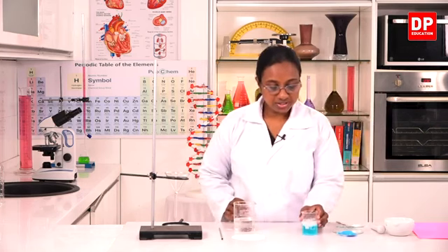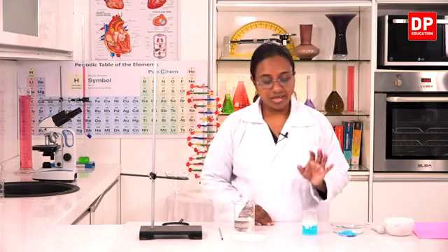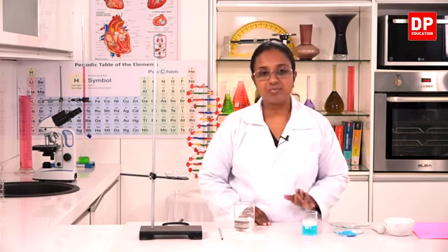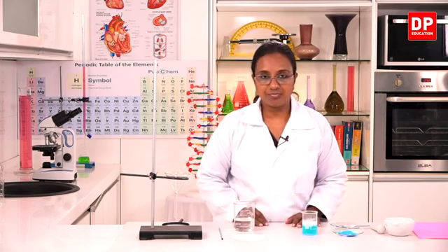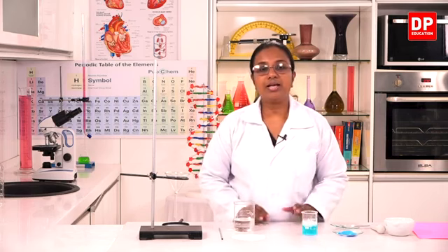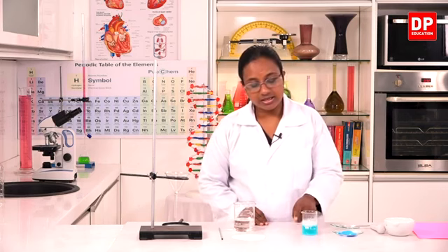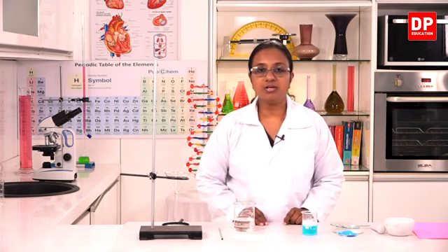So here students, you can observe that all the three components, water, copper sulfate and naphthalene are mixed together. So we have a liquid mixture. In that you can see the white color solid particles on top.